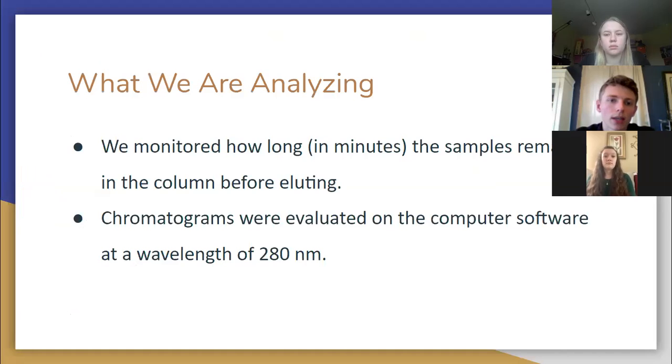So what are we analyzing? Generally said, we monitored how long in minutes the sample remained in the column before eluting. And then the chromatograms for this were evaluated on the computer software at a wavelength of 280 nanometers.